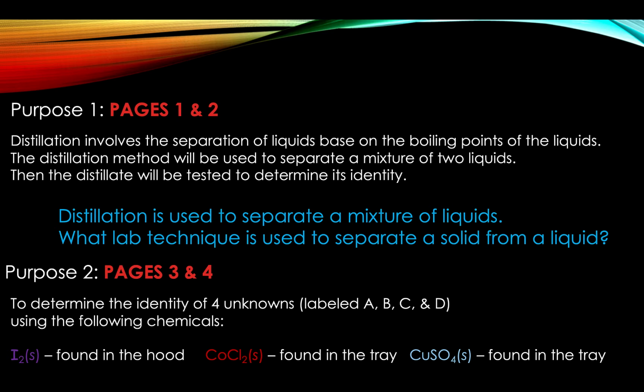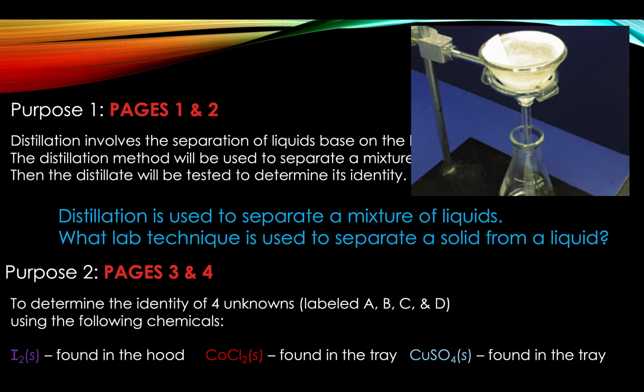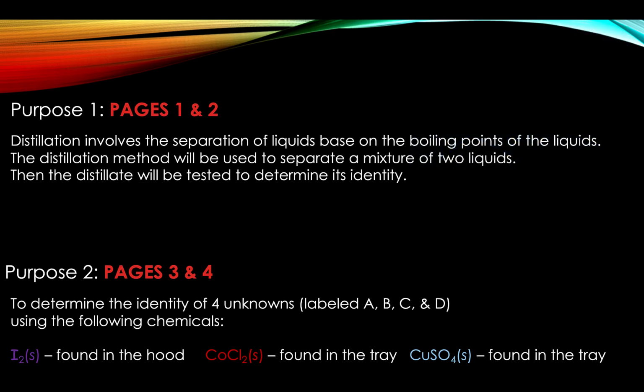Can you remember the lab technique that allows you to separate a solid from a liquid? That would be filtration. We will then test the distillate, or the liquid that was separated, to determine its identity.